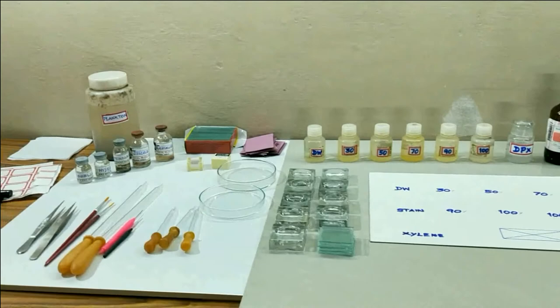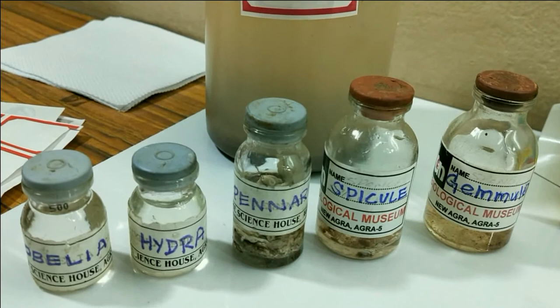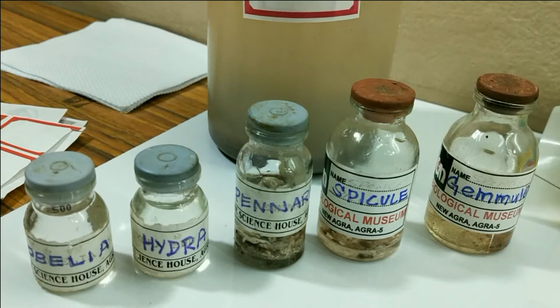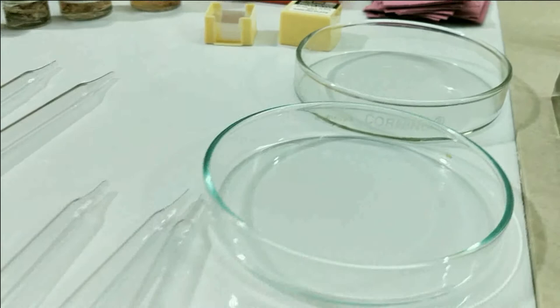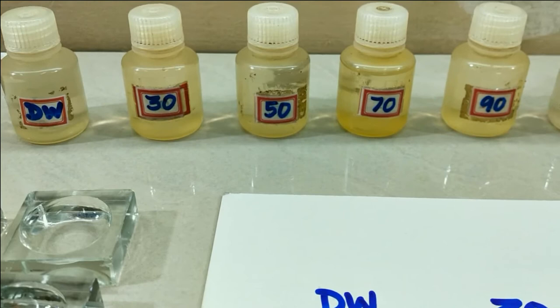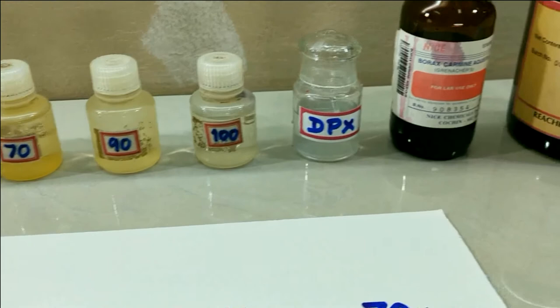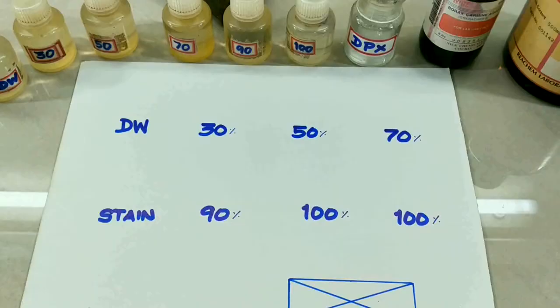What are the materials required? You can see here we have pre-fixed specimens: obelia, hydra, pennaria, spicule, gemmule, and plankton. Also micro slides, blotting sheets, cover slips, Petri dish, droppers, needle, brush, forceps, cavity blocks with lid, distilled water, different grades of alcohol — 30%, 50%, 70%, 90%, and 100% — DPX, stain, borax carmine, xylene, plus dissection microscope and compound microscope.